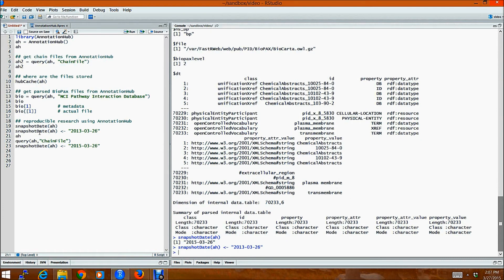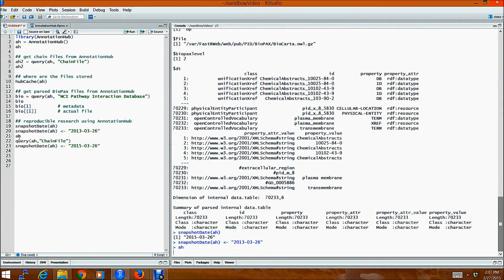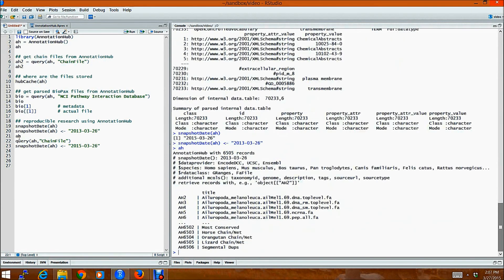which was used two years ago. You would simply set the date for two years ago. And then you would look at this object again. As you can see, the number of records has reduced from those 19,000 files to 6,505 files.